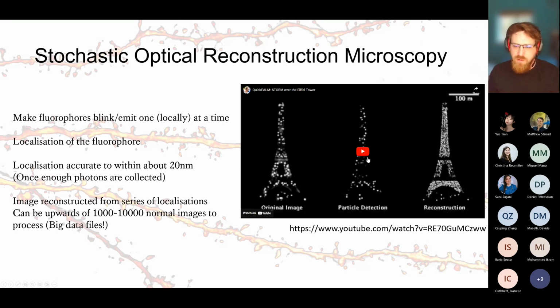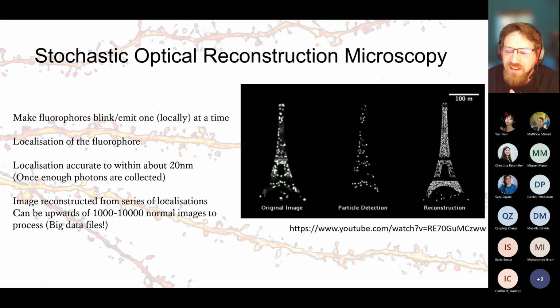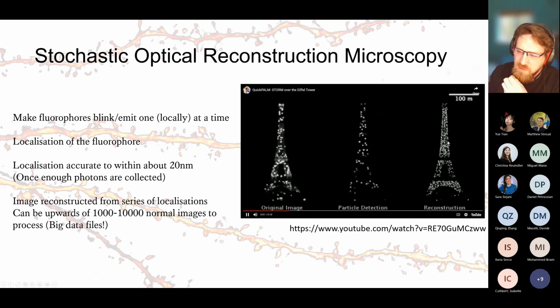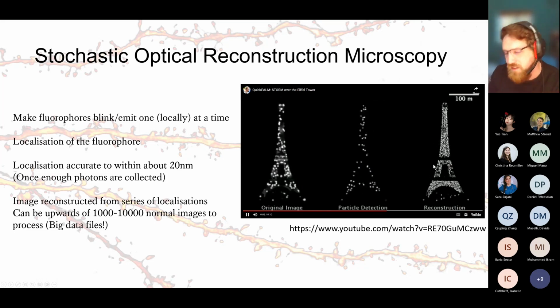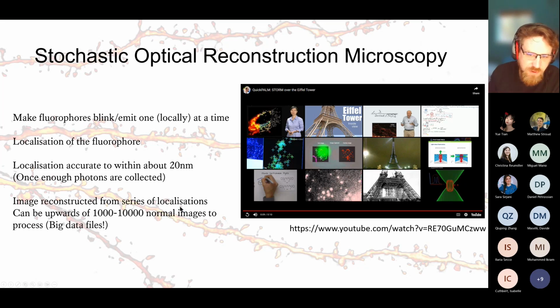And the way that it works to generate an image, one of the early developers of super resolution imaging, Ricardo Enrique, came up with this very apt video to demonstrate. He took a phone video of the Eiffel Tower and ran his particle detection scheme on it, and then if I repeat that a few times, you can see how each of the emissions is built up to yield a higher resolution image of the Eiffel Tower. So you can imagine, to actually obtain an image like you would for a microscope image, you've got to take many thousands of images, and obviously we have a system which can do that just fine, but it's just so you understand the basis of how that works.